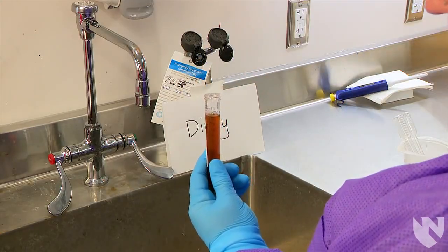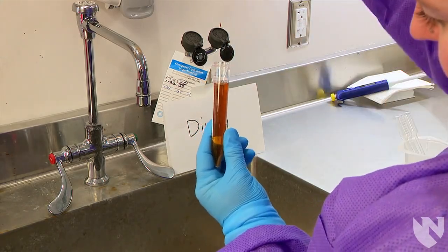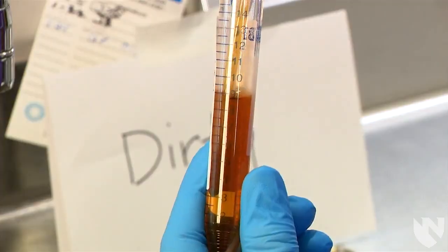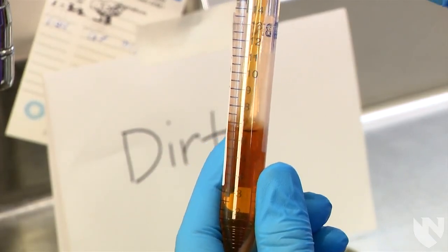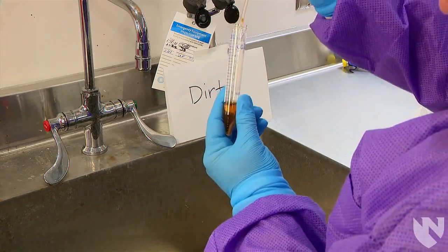Take the lid off of the conical tube and, using a disposable pipette, aspirate all but one milliliter of the urine supernatant. Make sure not to aspirate any of the sediment. Dispose of the supernatant in a labeled dirty sink.